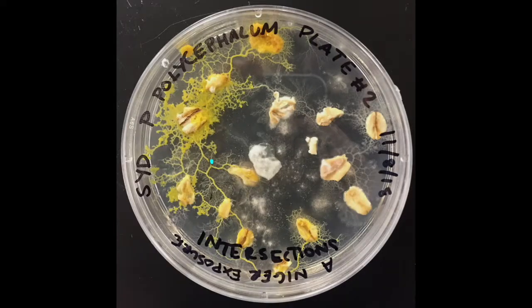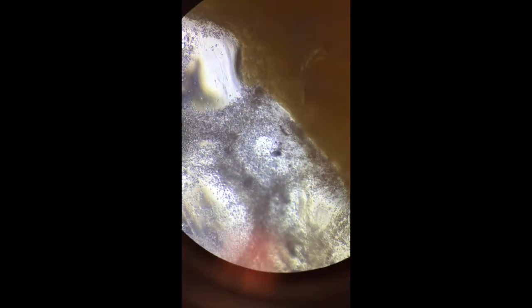Hour 47. Looking at the top one, same thing pretty much. Looking a little bit closer, it does look as though things are starting to move away in the region, although living slime mold does still occupy very proximal to Aniger — only cutting through at one point though.